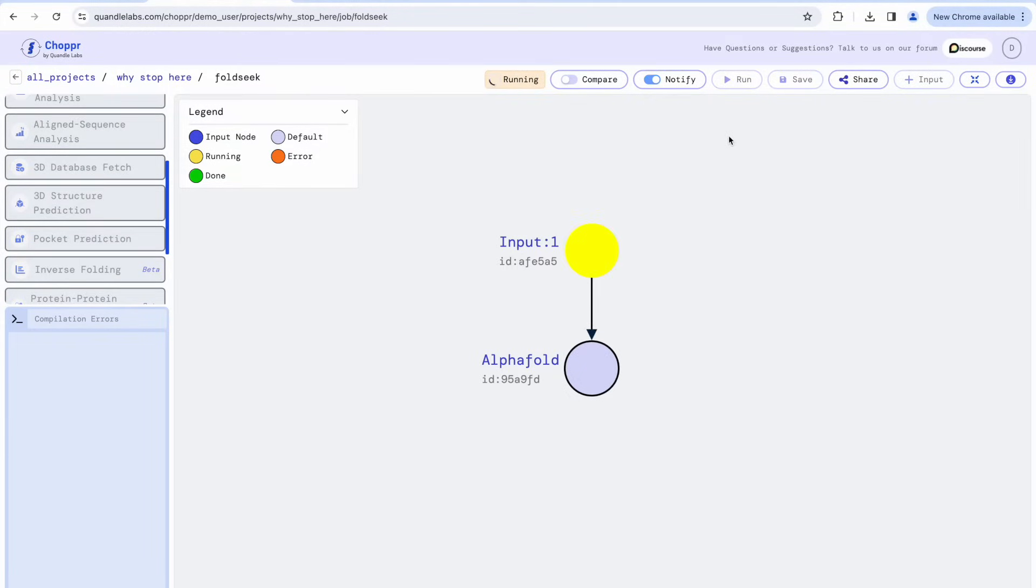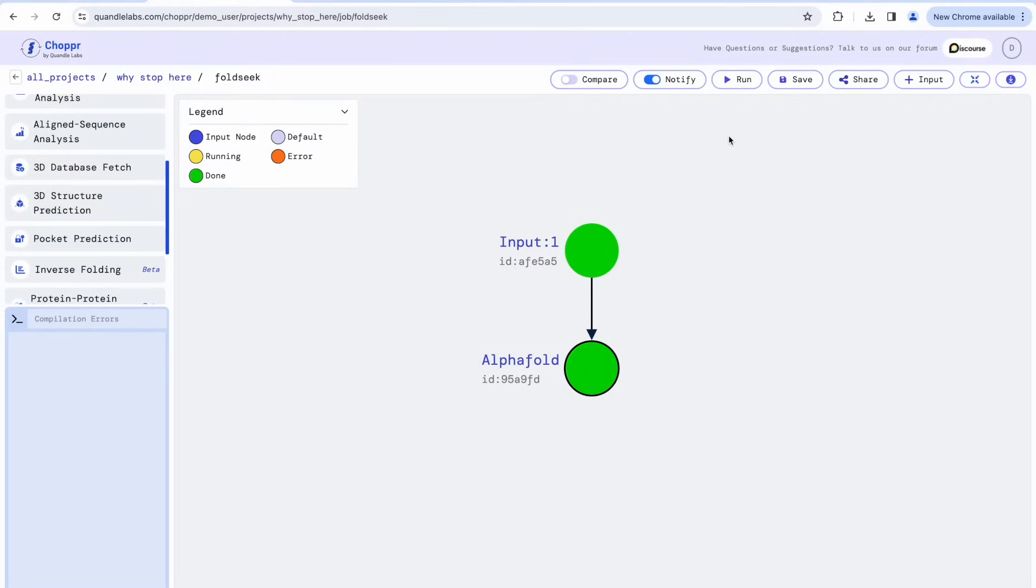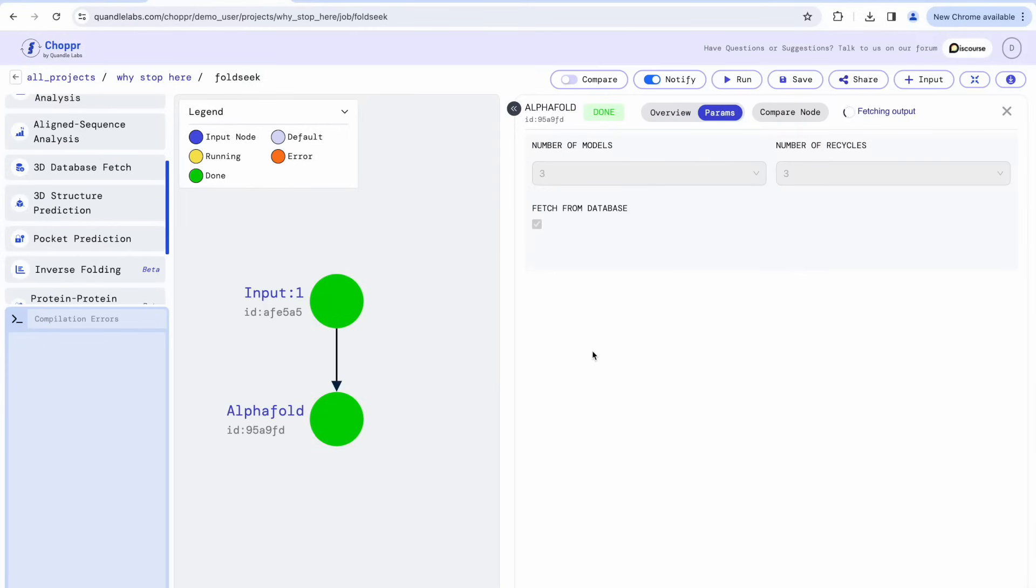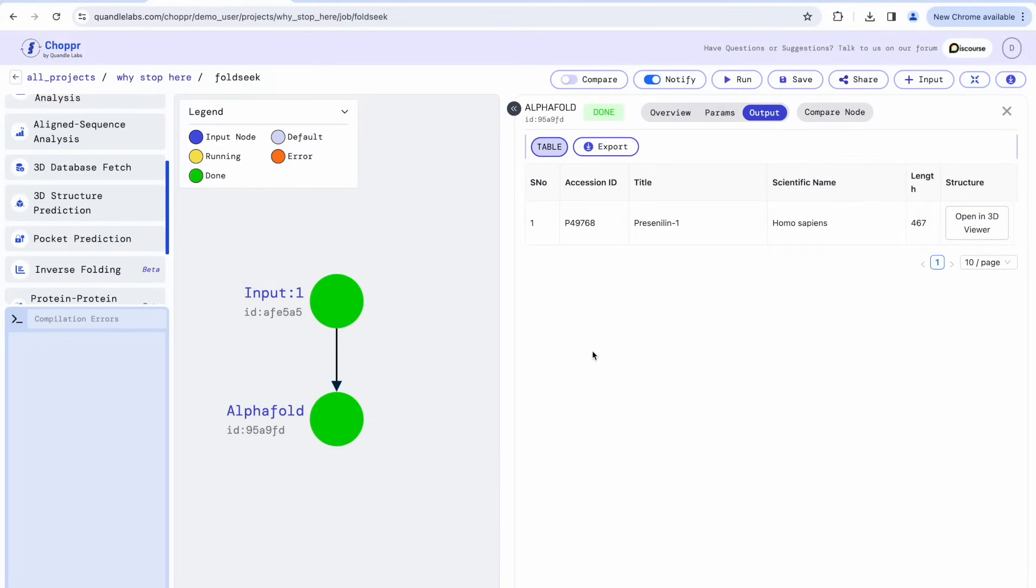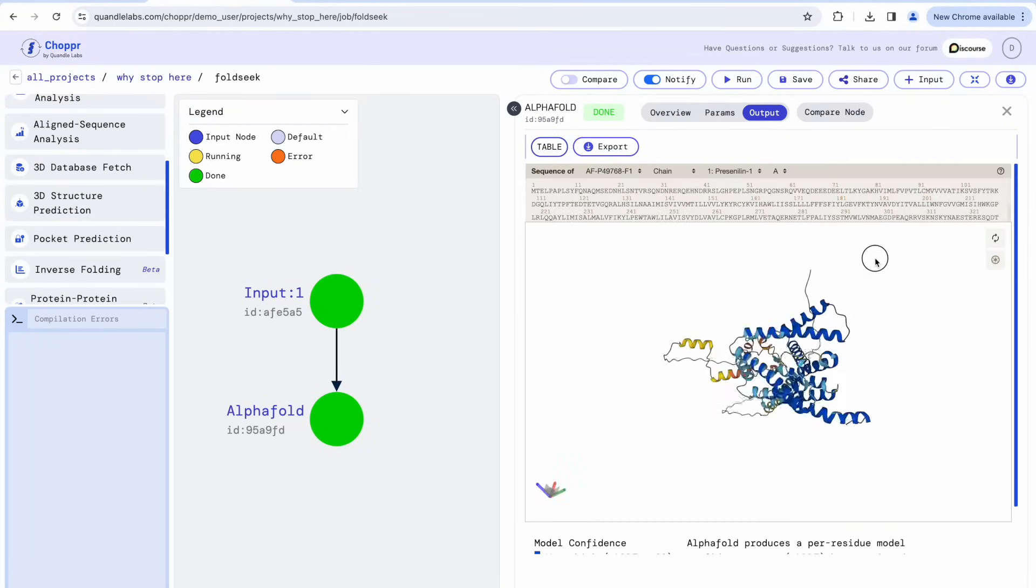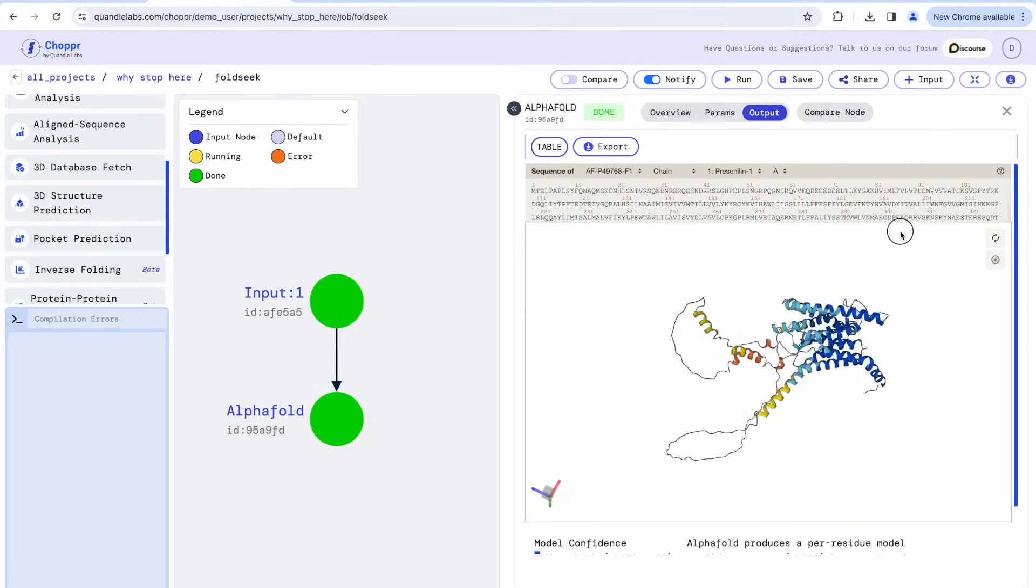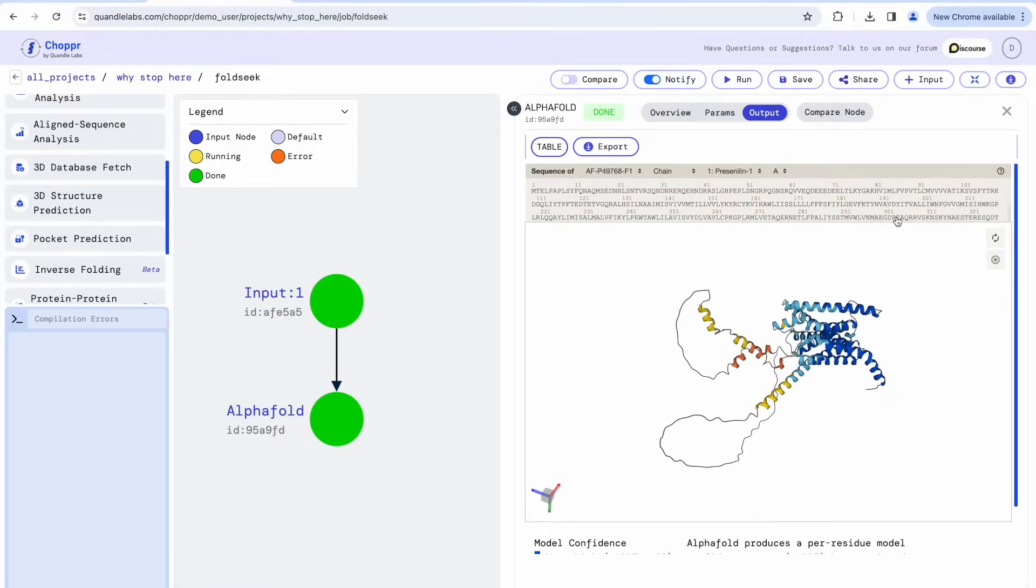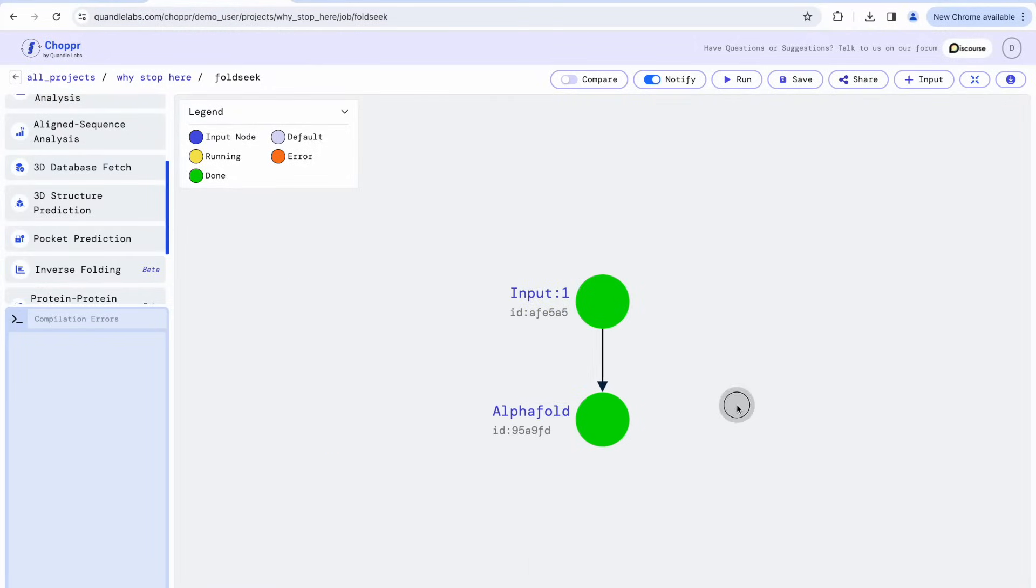Once the AlphaFold node has turned green, it means it has finished predicting the structure. We can check out the prediction by double-clicking on AlphaFold. Chopper has an inbuilt 3D structure viewer. In the viewer, we highlight the per-residue model confidence score, PLDDT, produced by AlphaFold.